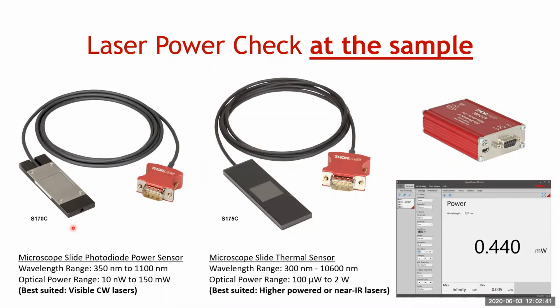Now in the facility, we do this as frequently as we can. Of course, some of the busier instruments, we can't get onto that often. But if you're concerned, we can teach you how to do this yourself. This one's more useful for visible wavelengths, and this is more for multi-photon and high-powered lasers. But I just wanted to get across the idea that nothing is as stable as you think.